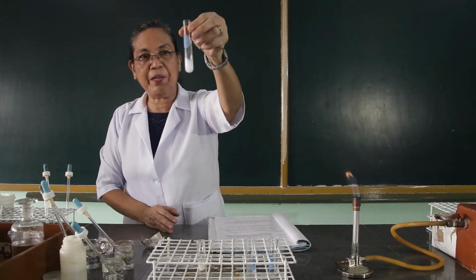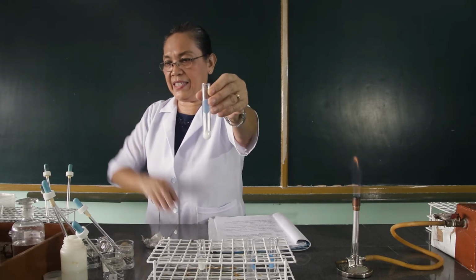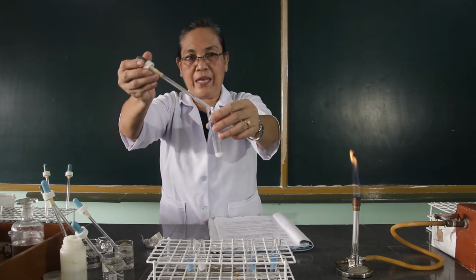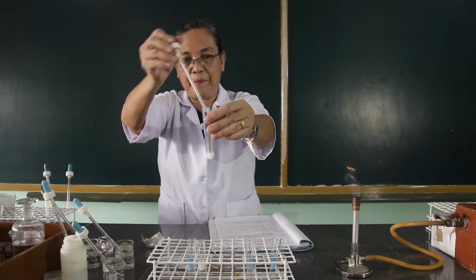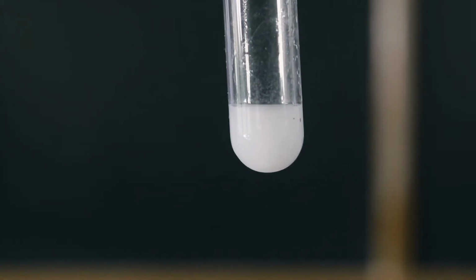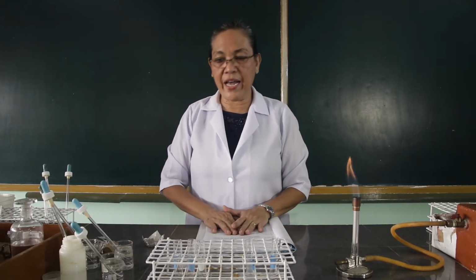Then, from this mixture, we're going to add diammonium orthophosphate. And I want you to observe what happens. Then we're going to have a flame test for barium ion.